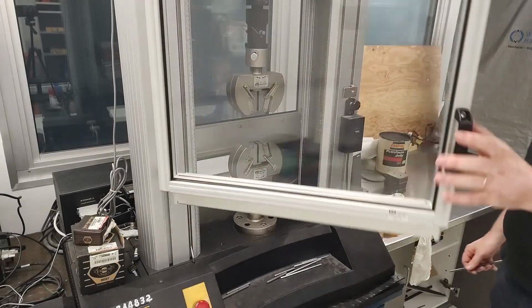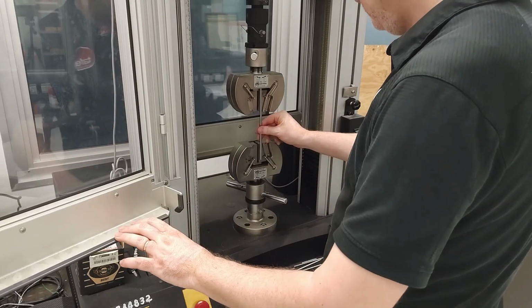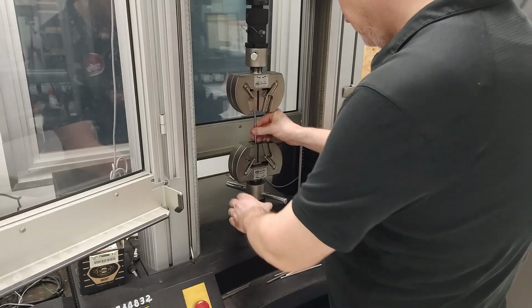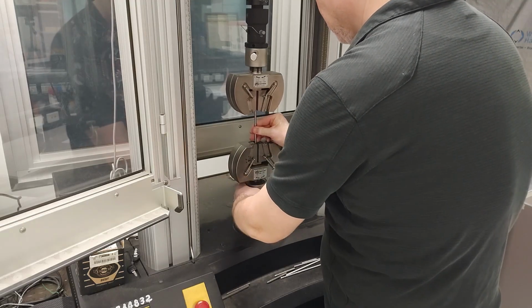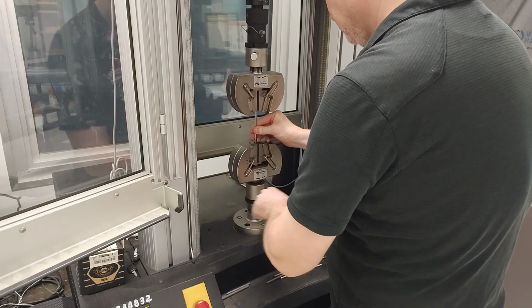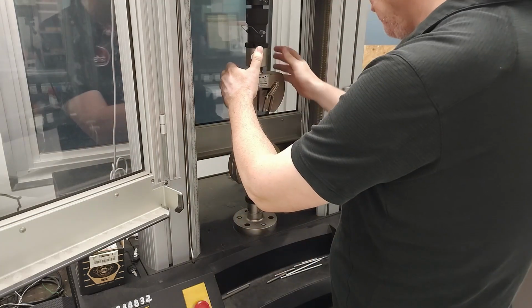We will now load the mild steel sample into the universal testing machine. The sample is held by wedge grips that are self-aligning. This type of clamp is ideal when high clamping forces are needed. In this test, we will not attach an extensometer.